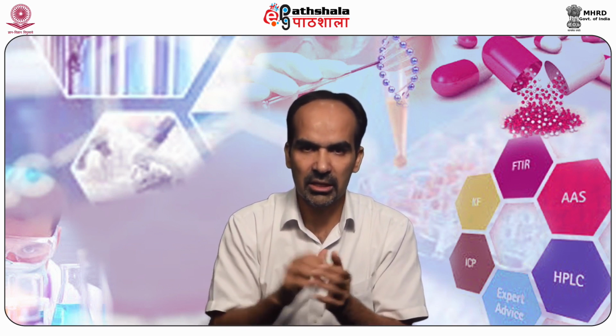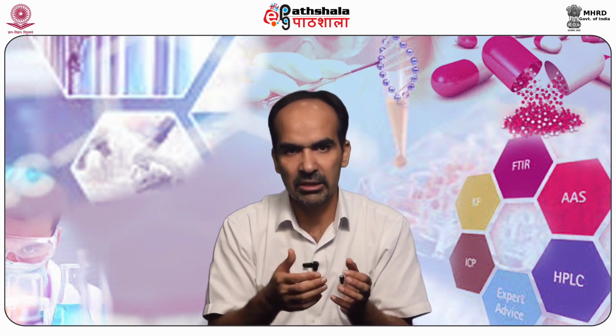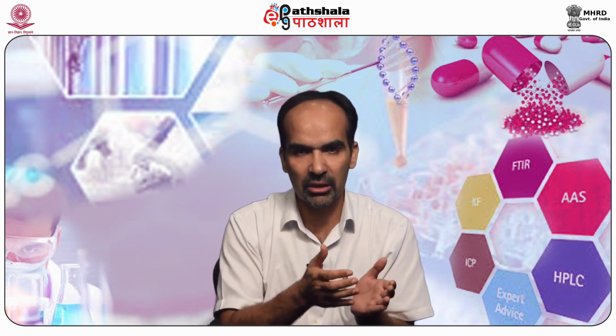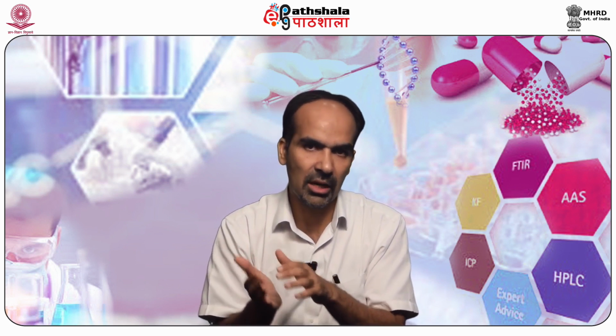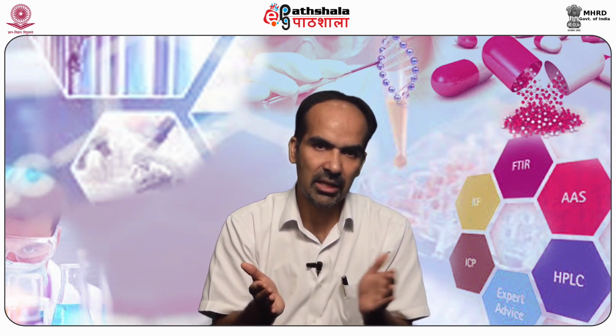The solution is shaken with acidified water in a separating funnel. The alkaloids then pass into solution in the aqueous layer as salts, leaving non-alkaloidal extractive matter in the ethereal layer.